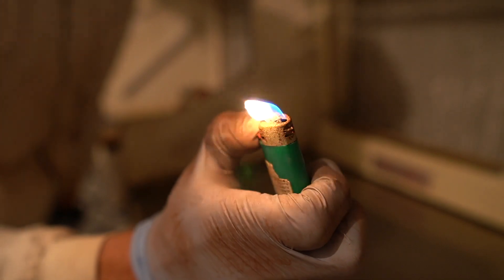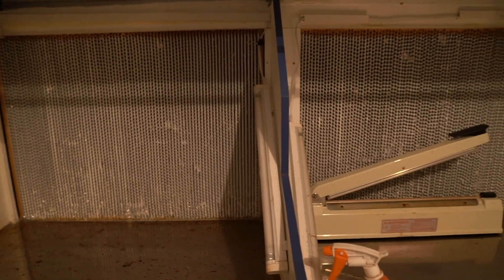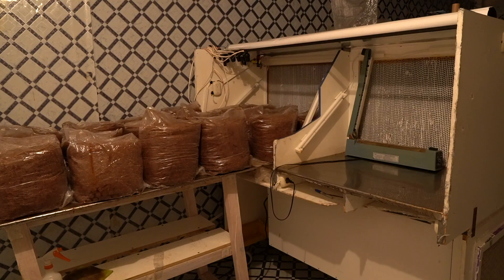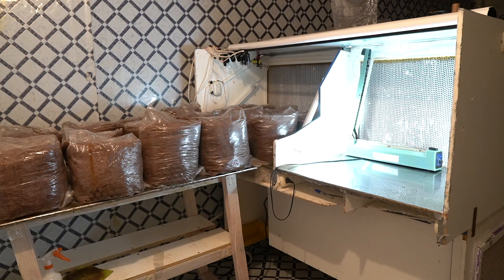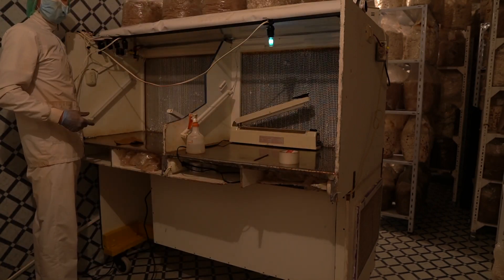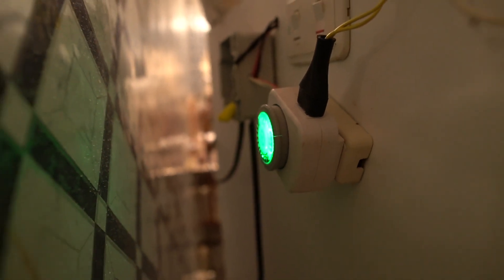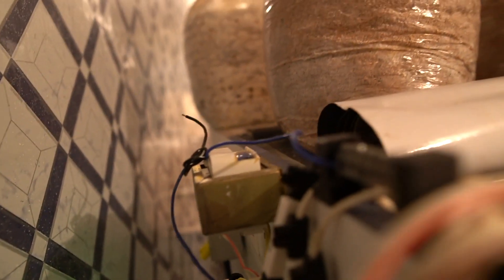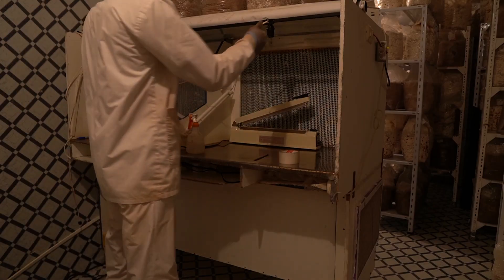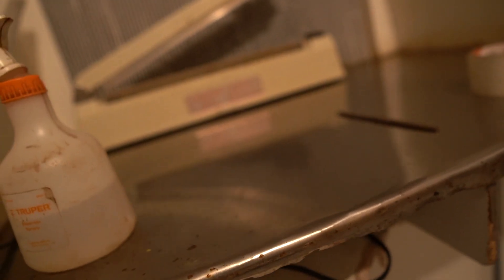A few things I would have changed if I built this from scratch: the two-compartment setup isn't bad, but I would have done one wide filter — like a four-foot wide filter — instead of these two 36-inch wides. The other thing I do, and this is to the nth degree, is I have UV lights that cycle on a timer to clear the space and allow nothing to grow in there. It's overkill, I'll admit, but it's peace of mind. I also used stainless steel to plate over this laminate wood — both are really nice options.